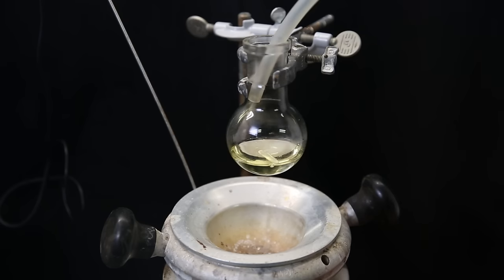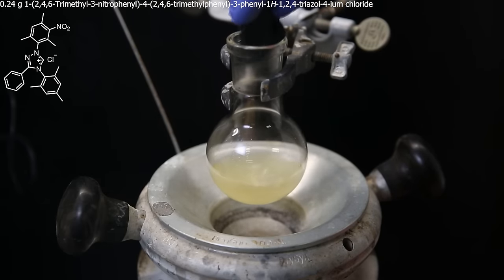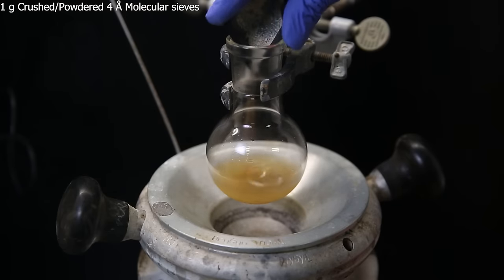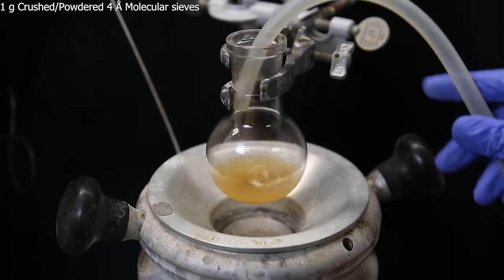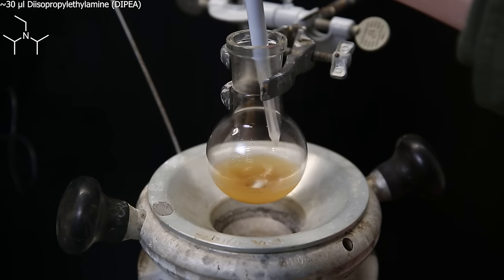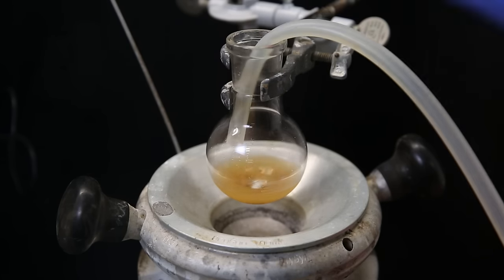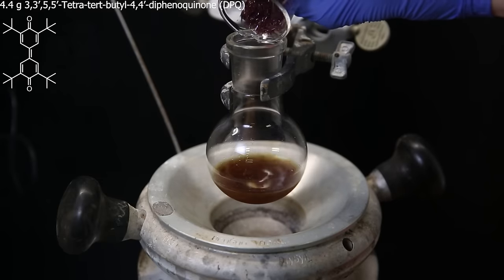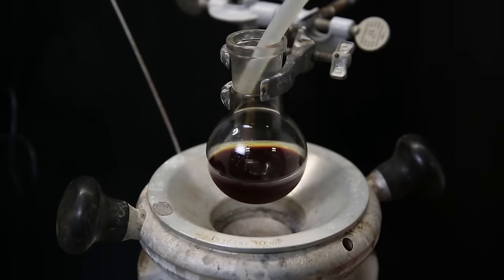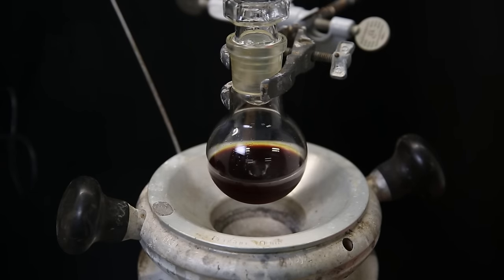I constantly flush the flask with nitrogen in between steps, and add 0.24 grams of the triazolium catalyst that I made before. I then add in 1 gram of crushed molecular sieves. As the base for this reaction, I add about 30 microliters of diisopropylethylamine, and pipette it up and down a few times, to make sure it all goes in. Then as the last reagent, I add 4.4 grams of the oxidizer DPQ that I made. I wash the beaker with some anhydrous THF, flush the flask with nitrogen, and then stopper it, and leave it to stir at room temperature for 16 hours.